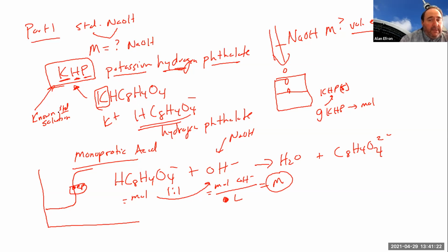And we're going to do a titration. If I'm not mistaken, they will have you do the whole titration curve. You'll also be looking for a change in color, because I think they will have you add some indicator in the software as well. Just like in person, you'd be looking for that really light pink color to tell you that you've reached the equivalence point, and you would want to note that volume as well. That's the goal. Any questions on part one?